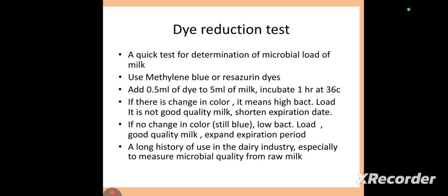0.5 ml of dye is added to 5 ml of milk and incubated. After that, if there is any change in color, it means high bacterial load and it is not good quality. If there is no change in color, it has a low bacterial load and is of good quality.